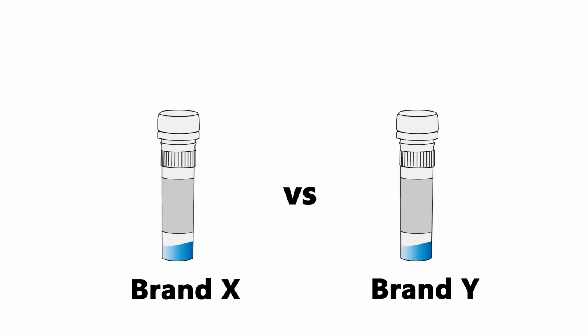The composition of the buffer varies with the type of polymerase used. Different companies produce different types of PCR buffers. It is therefore important to follow the recommended guidelines from the company.